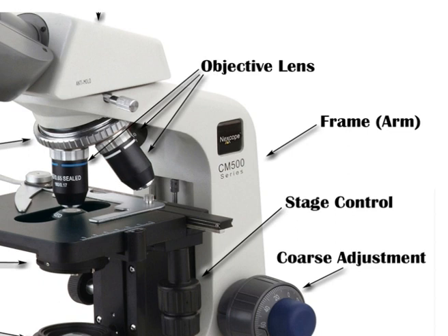The typical magnification of an objective lens depends on the intended application. Normal groups of lens magnifications may be 4x, 10x, 20x for low magnification work and 10x, 40x, 100x for high magnification work.